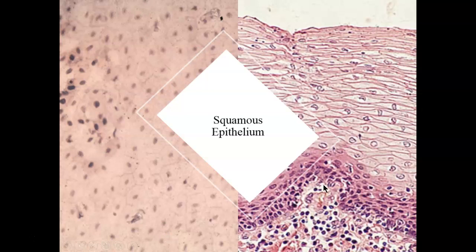So the epidermis begins right here at this dark layer of cells. So you can see it is attached to a basement membrane. See that little sort of pinkish looking line there? And then you have connective tissues below that. So from here down is dermis, and from here up is epidermis. Layers and layers of cells, much more squashed or squamous in appearance as you get closer and closer to the surface.